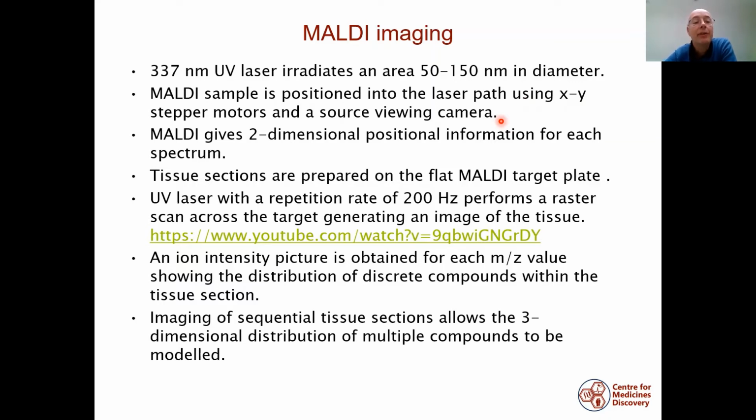What that means is every spectrum that you generate in a MALDI analysis has not just the mass data and the spectrum, but also the two-dimensional positional information for where that spectrum was acquired from, where the laser hit the target. So you can prepare a tissue section onto the MALDI target plate and spray it with a matrix solution.